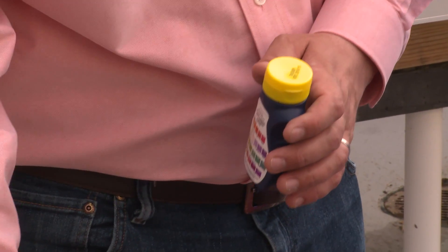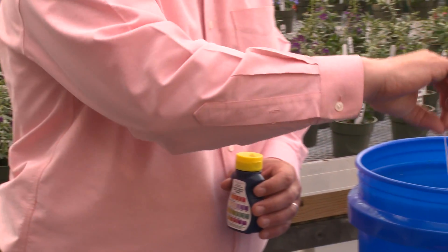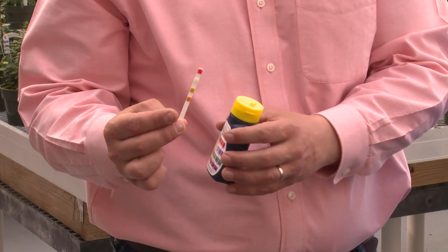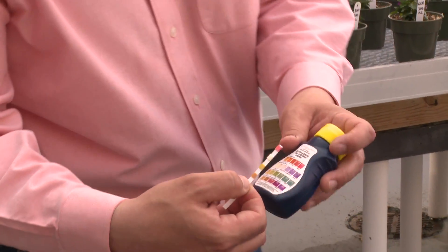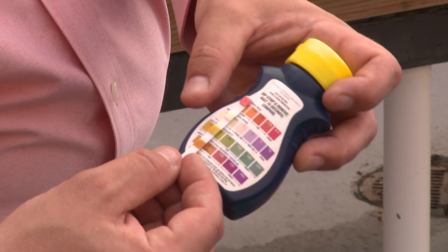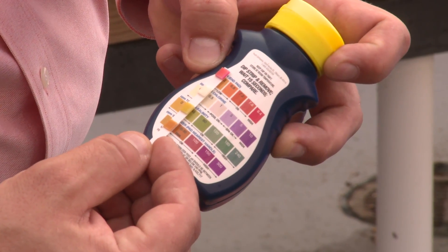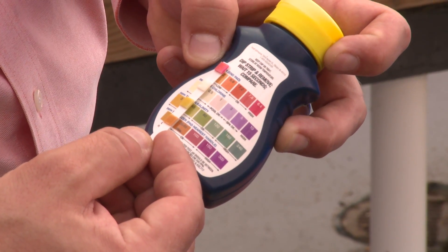To perform this test, we simply take a test strip, dip it in our representative irrigation water solution, and wait 15 seconds in order to let any color changes take place on the strip. Once 15 seconds has passed, we can take our strip and compare it to the color chart on the back of the bottle. We can see here that alkalinity — the second tab from the bottom — is somewhere between zero and 40 parts per million based on the colors. Again, this is only a rough guideline using a colorimetric determination of alkalinity.